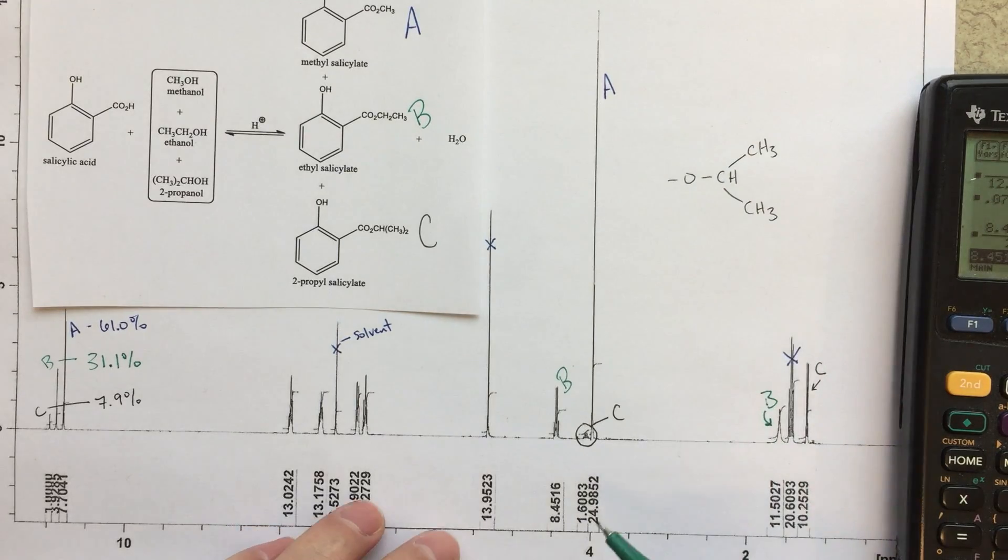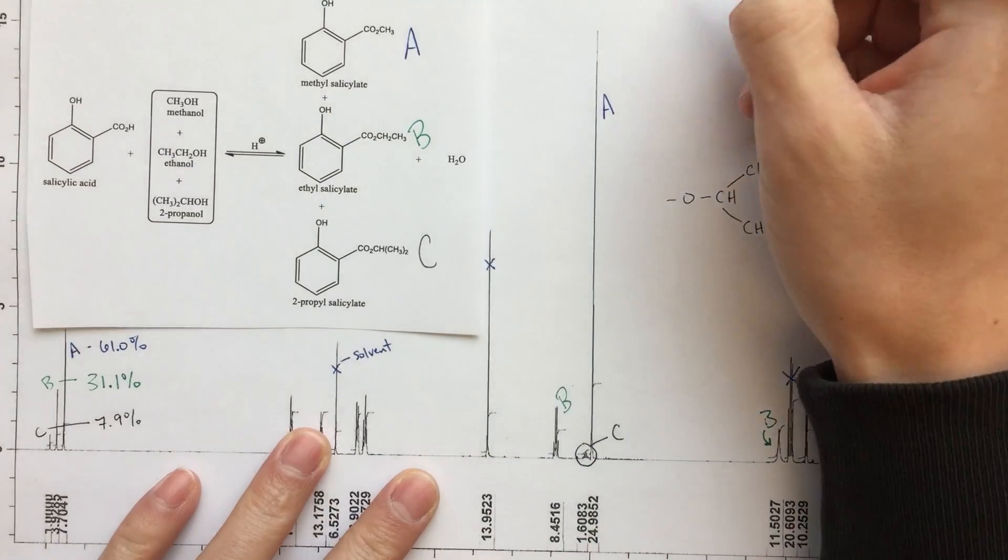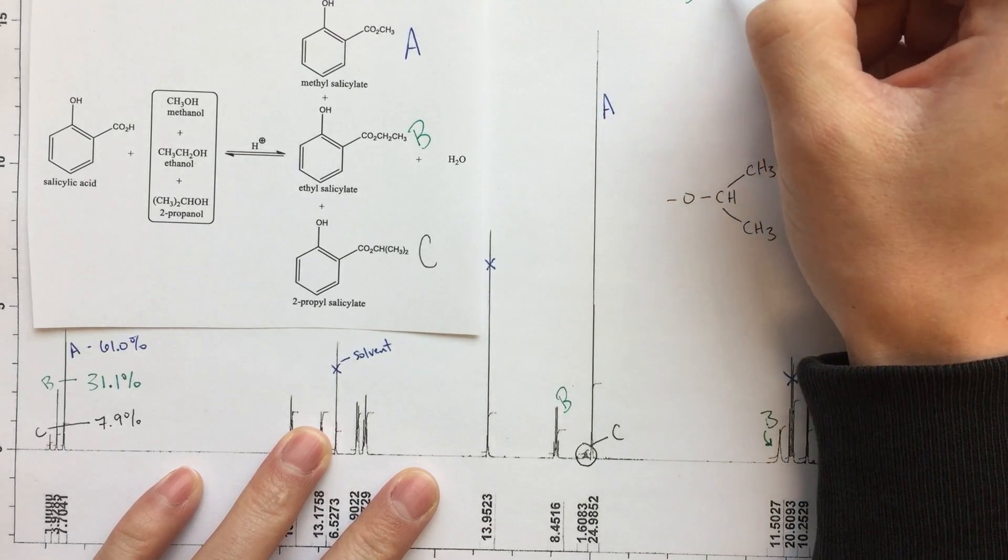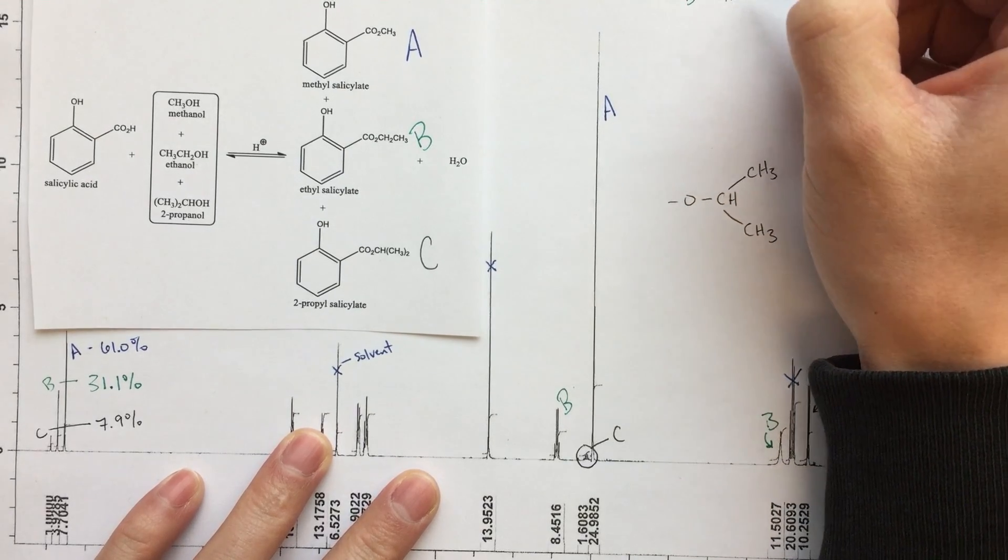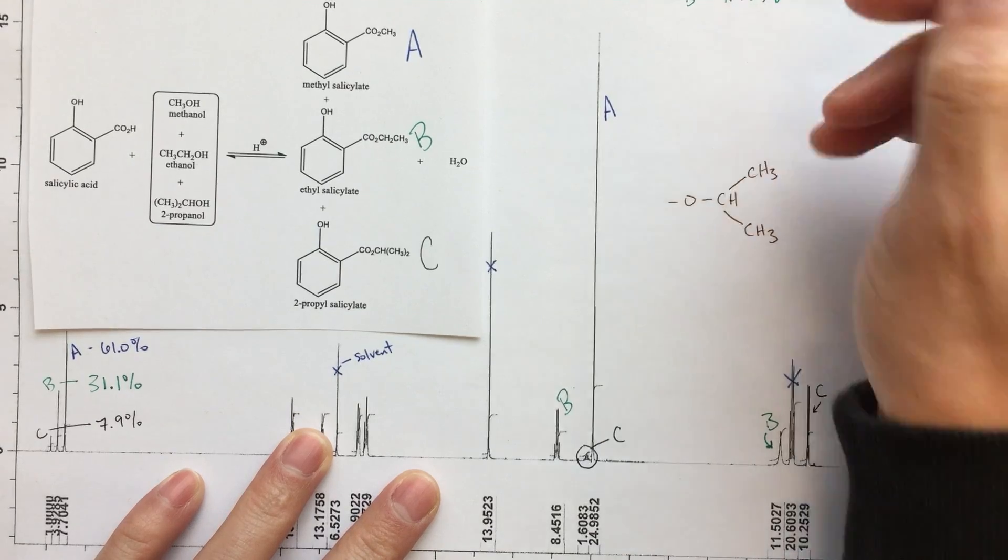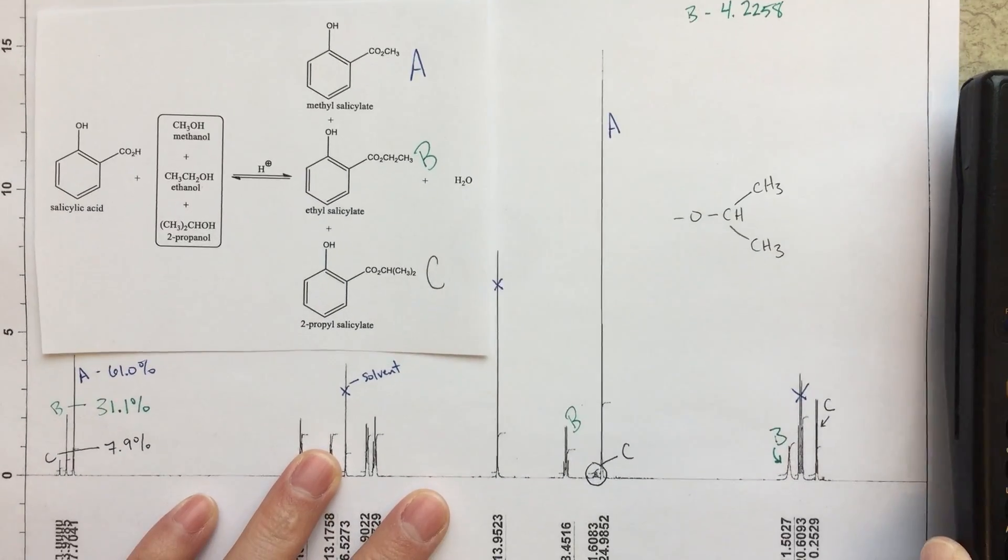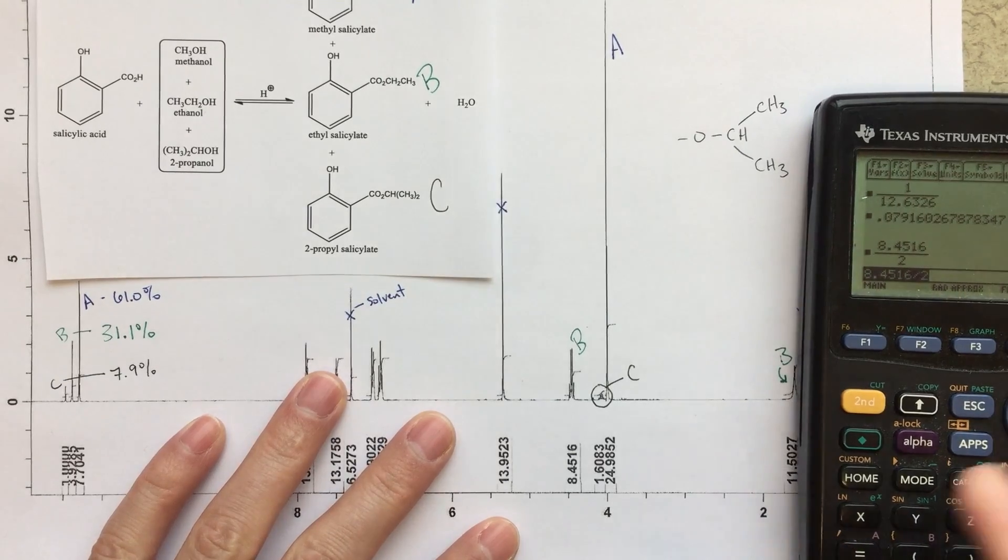So we'll write it maybe up here. B is going to be, the integral should be 4.2258, and I guess I should make it so you guys can see that as well. We'll show you in a second.